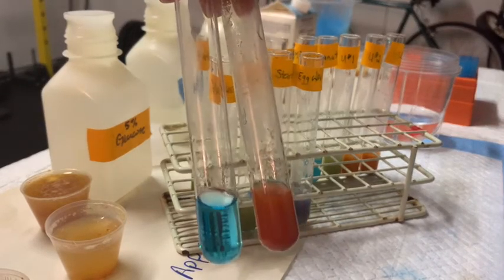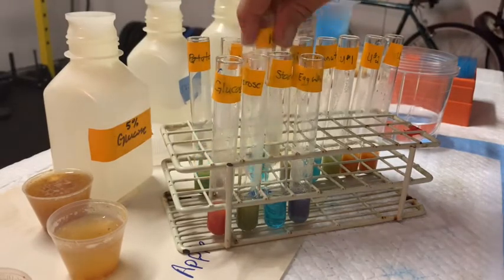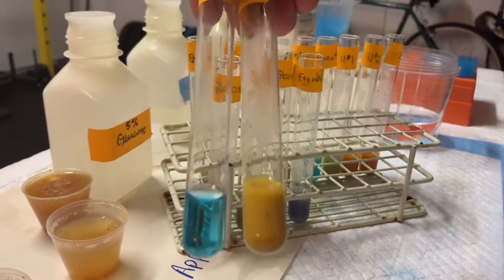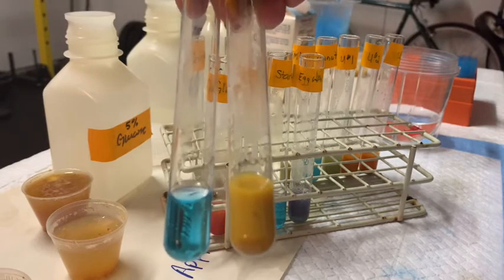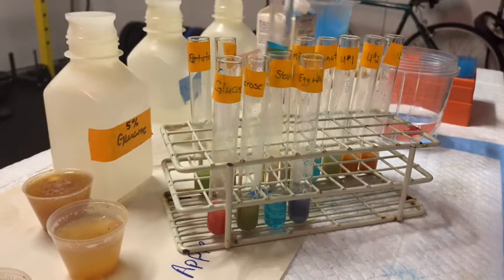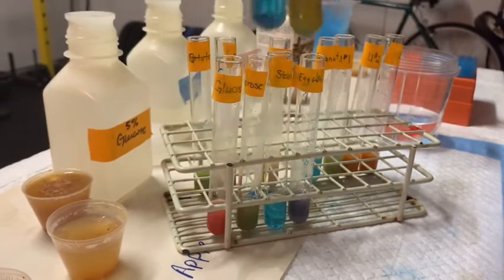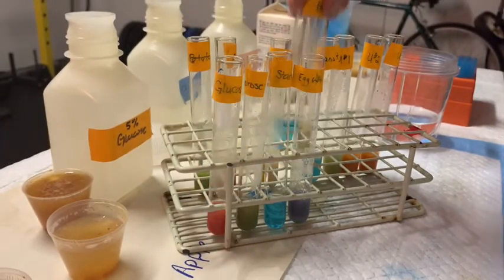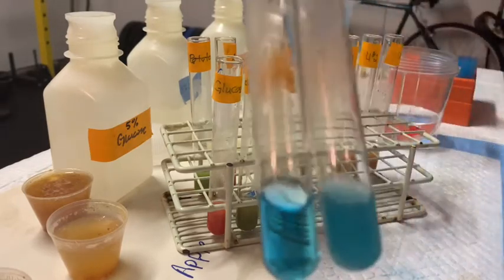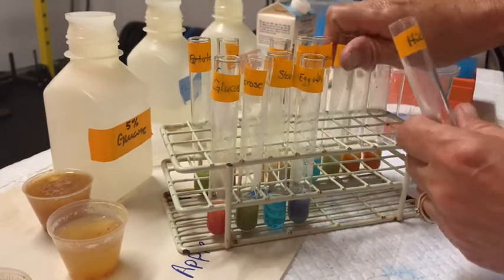The apple is nice and red, which makes sense because apples are relatively sweet, so there's probably a good amount of glucose. The onion — a sweet onion — shows a yellowy-orange color, again indicative of the presence of at least one monomer being a reducing sugar. Milk shows a greenish color, which is a positive reaction. The peanut butter — organic peanut butter — is still blue, so I wouldn't really expect it to have too many sugars.